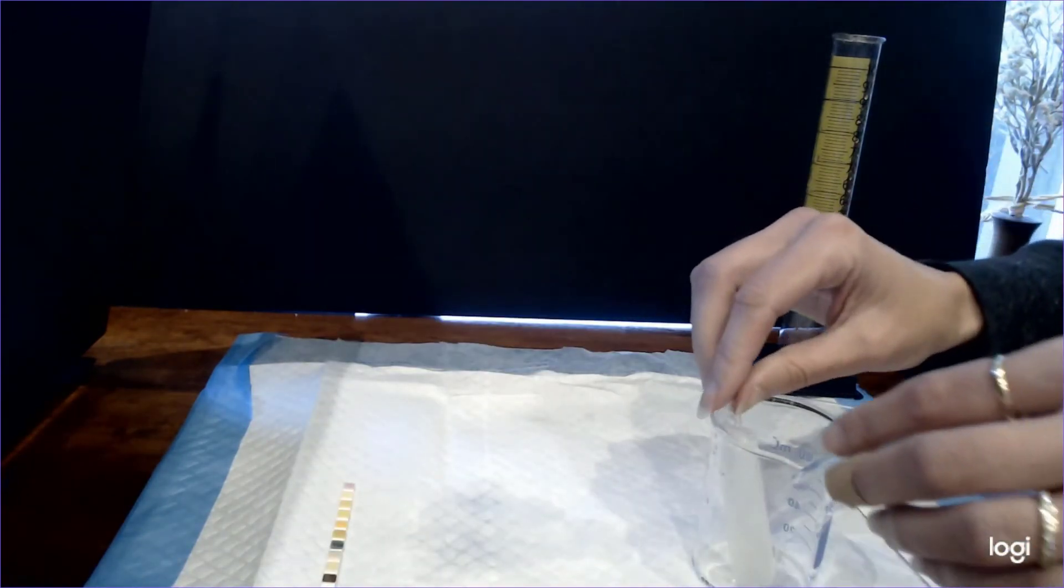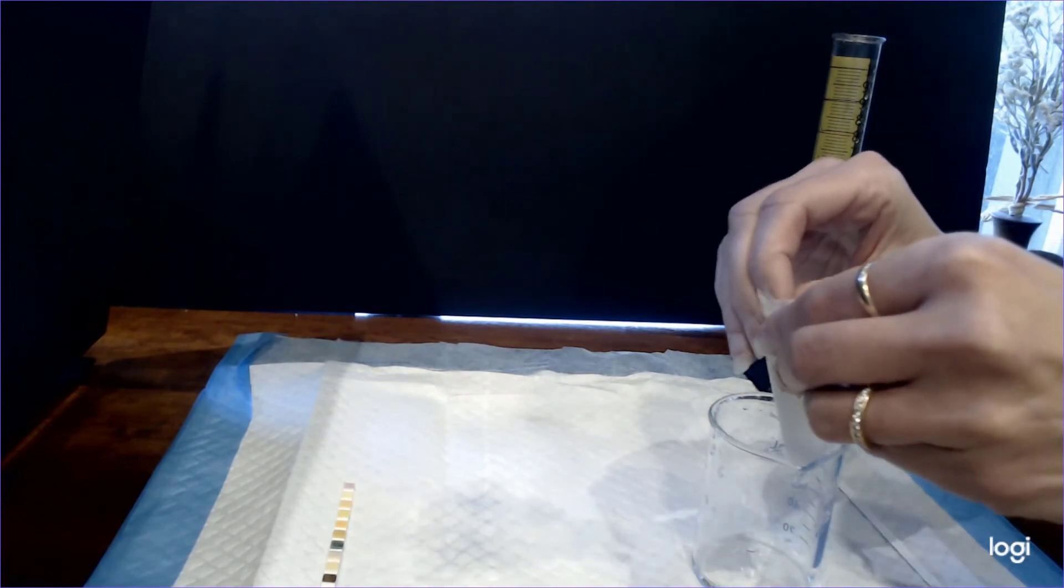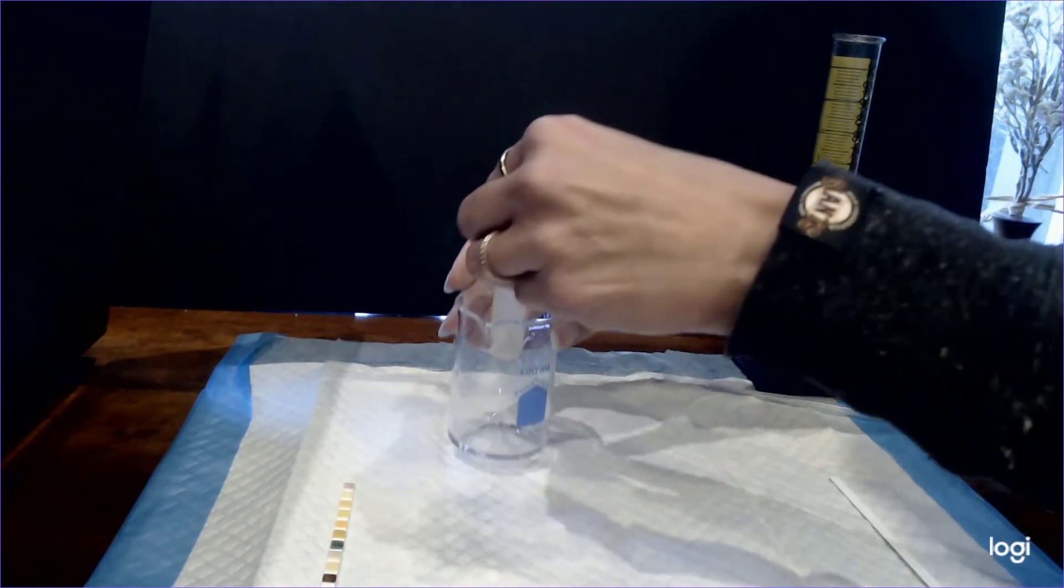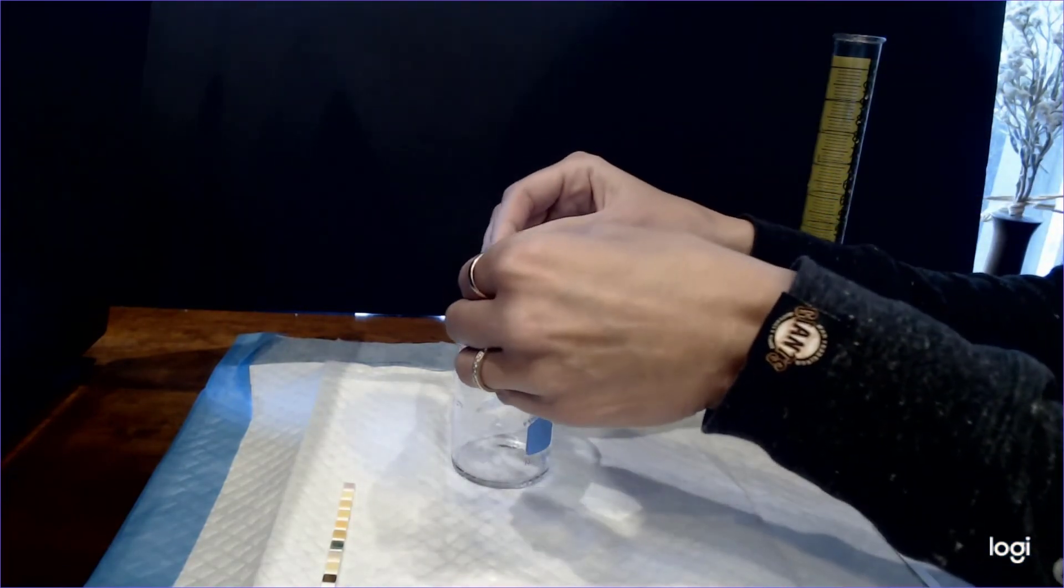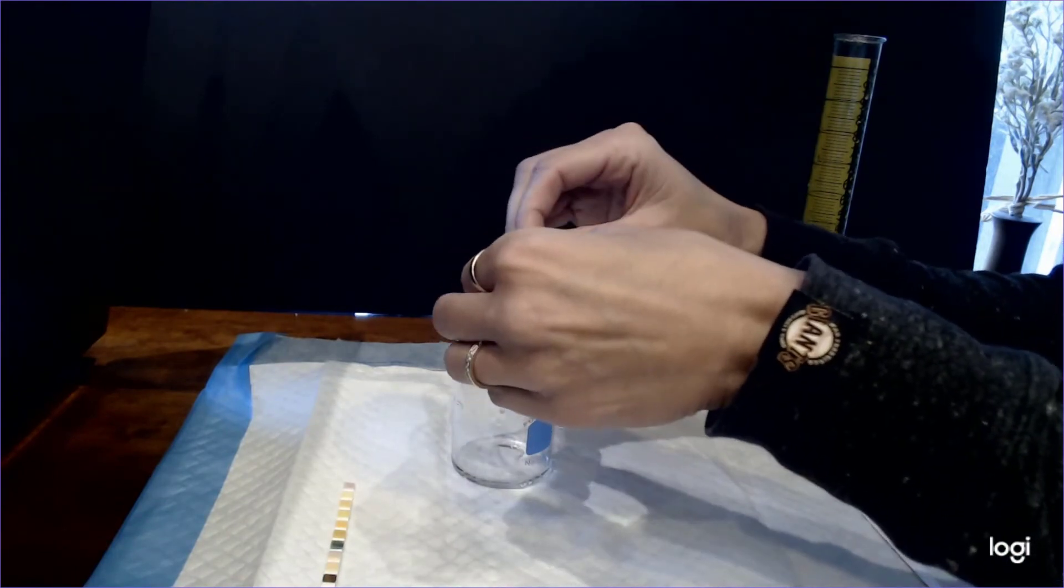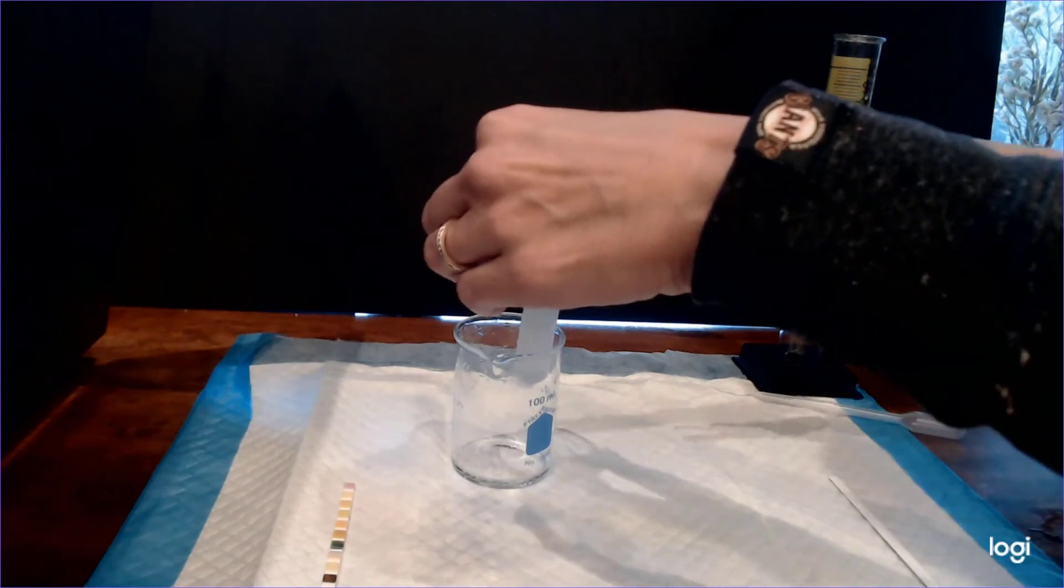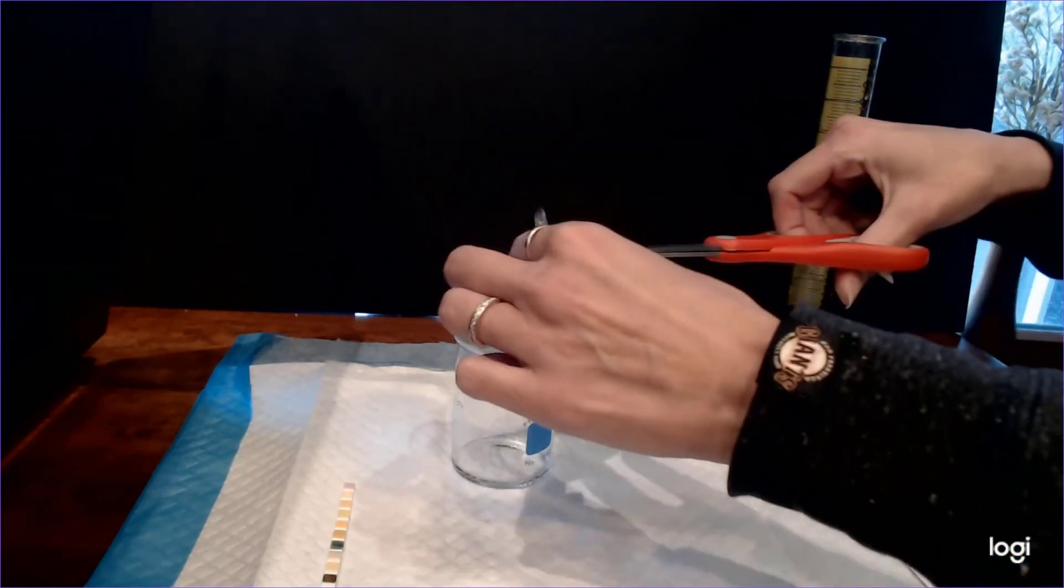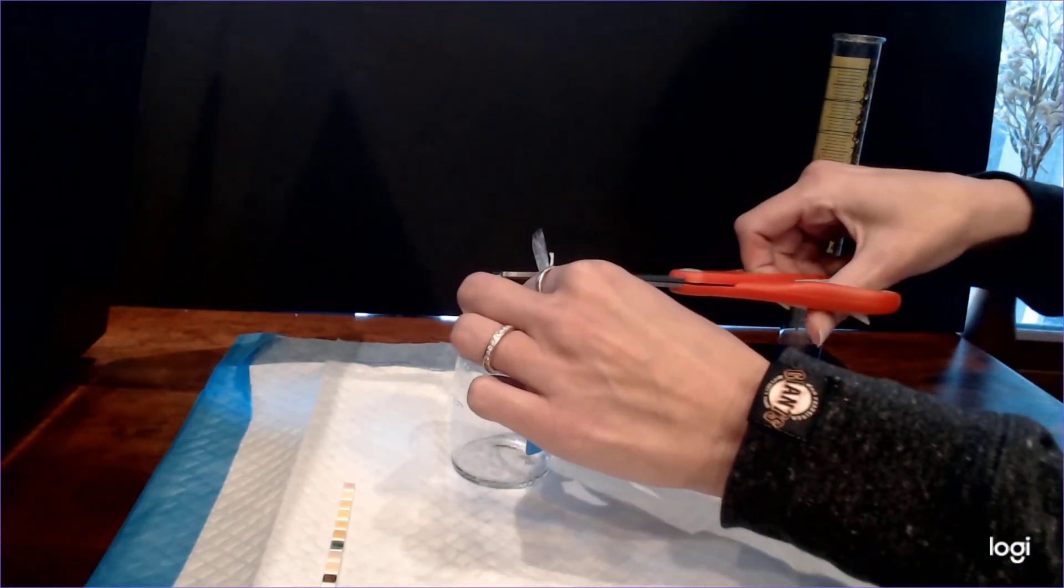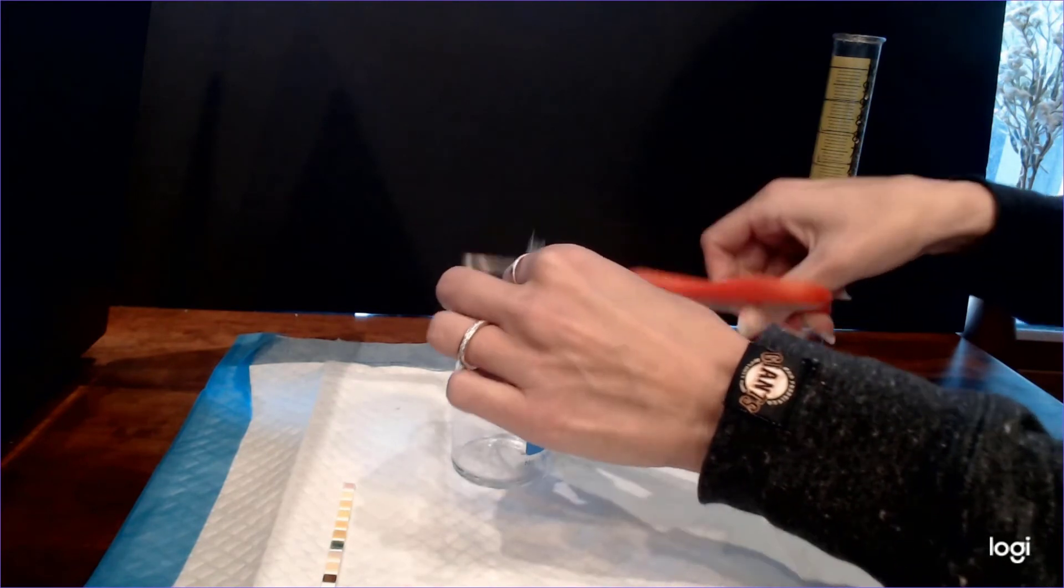Alright our last step is just basically to confirm that there is in fact glucose and protein in our dialysis bag so that we can get a positive control for what glucose and protein looks like on the dipstick.